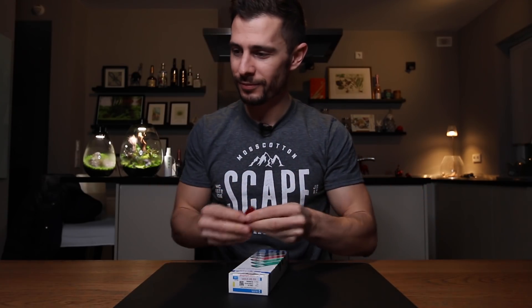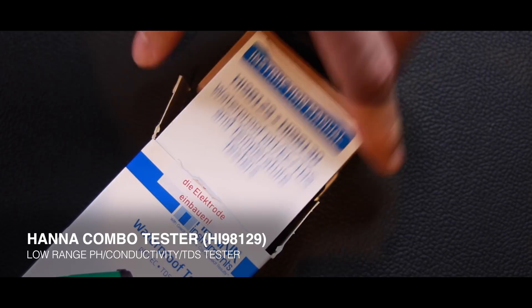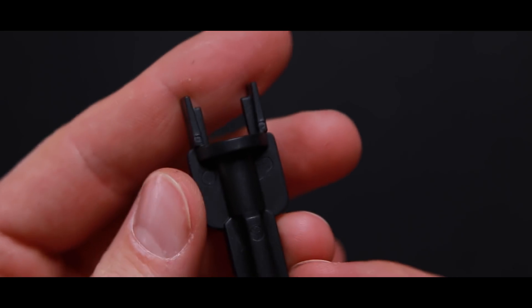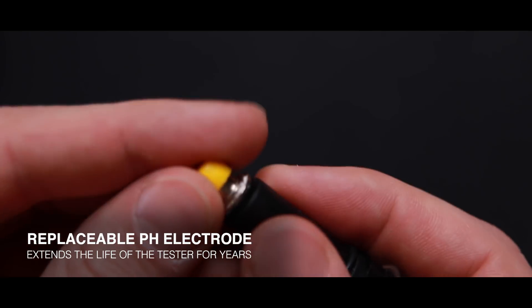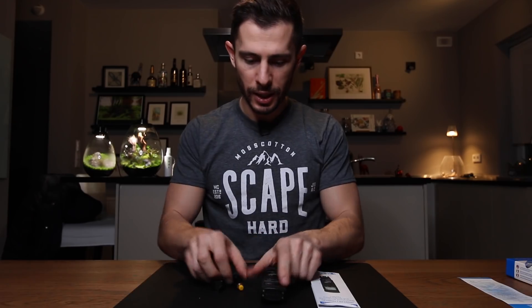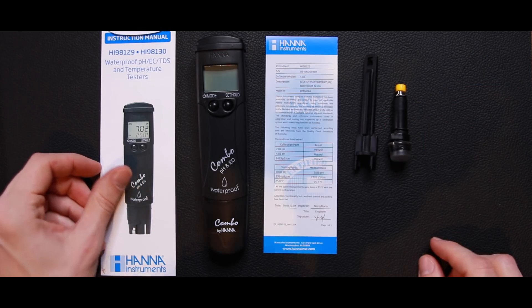So now let's open the box and look what is inside. We have the instruction manual, the warranty card, and a little pen tool to insert and remove the pH electrode. One of the first great features of this product is that the pH electrode can be replaced, which means this is a long-lasting device. And here comes the little multi tester itself. So the main components are: the manual, the tool itself, the pH electrode, and the tool to insert the pH electrode.